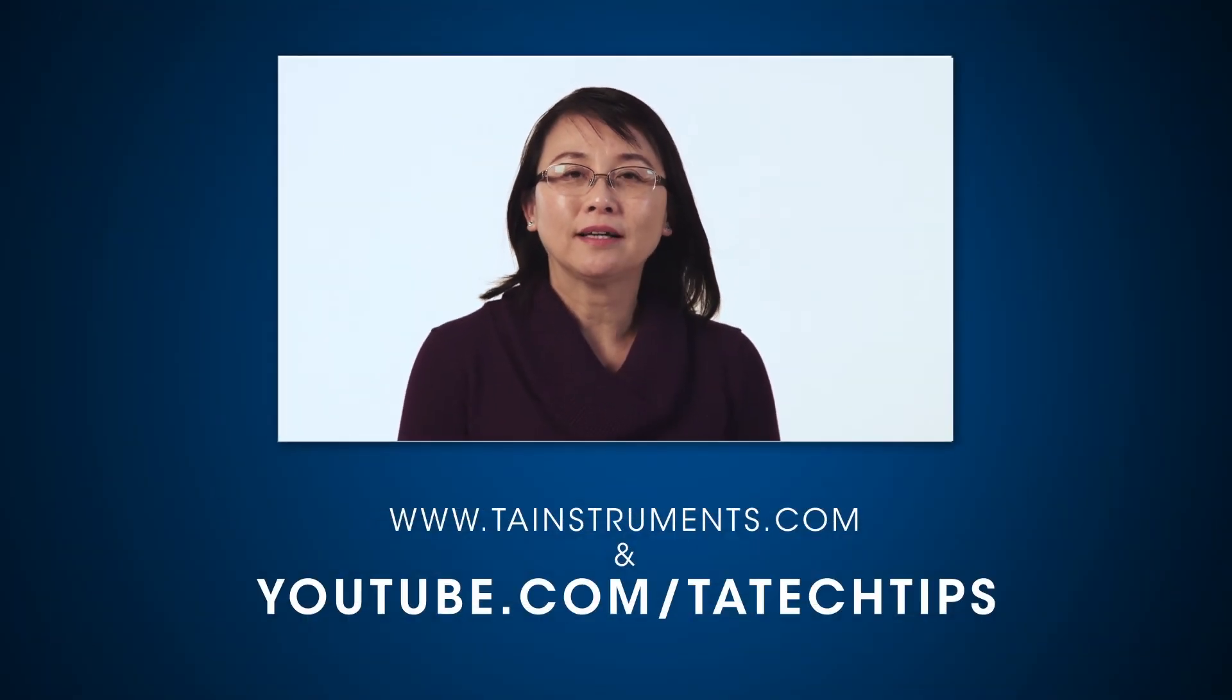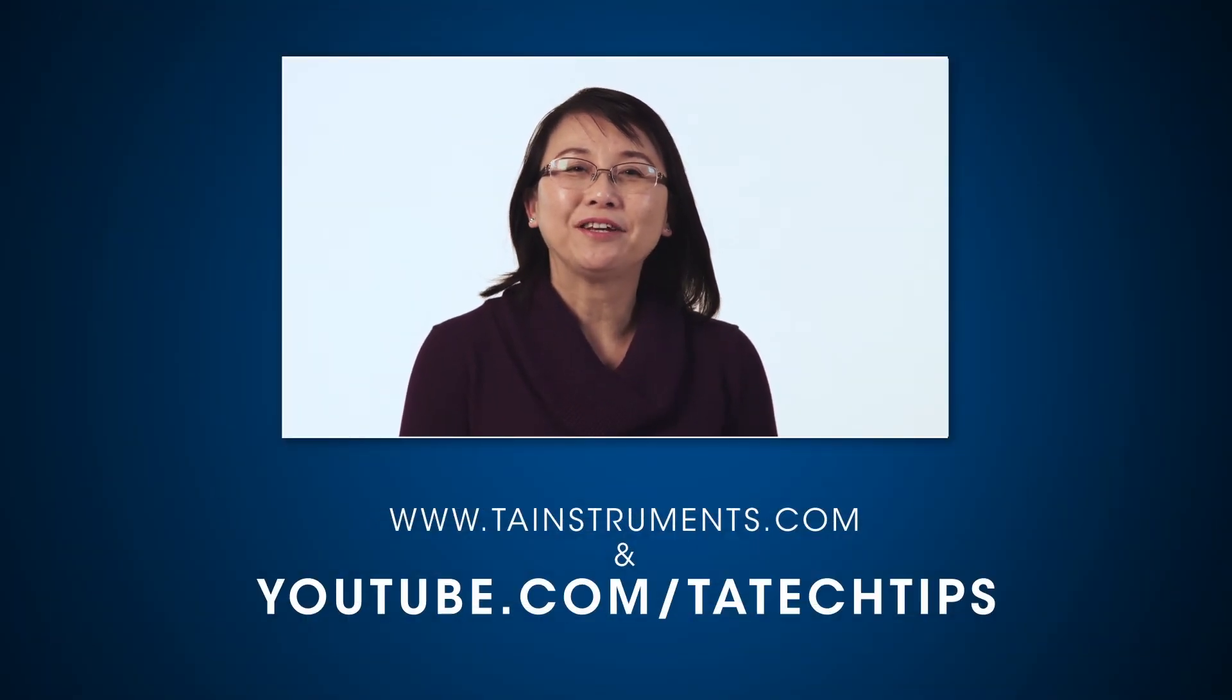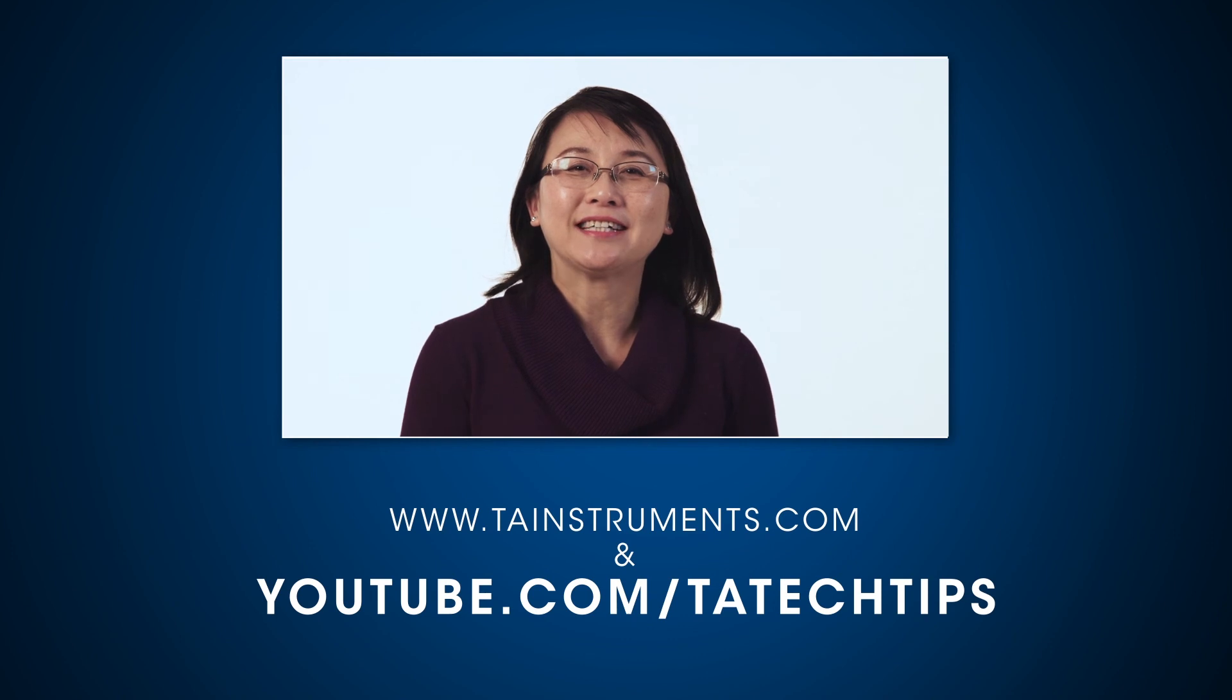In this tech tip, we have demonstrated how to install and calibrate a three-point bending clamp on a DMA 850. Please stay tuned for more TA Tech Tips and thank you for your interest.